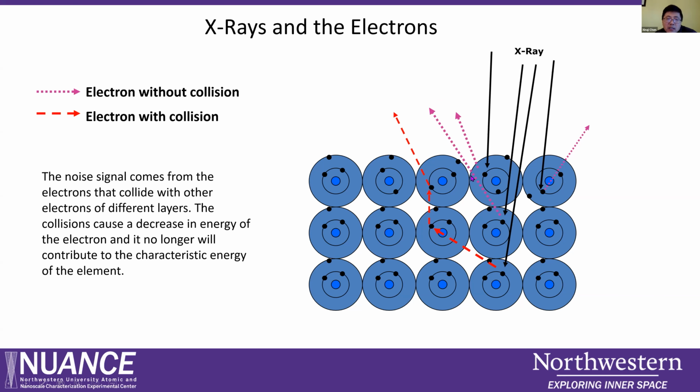So that's why on the spectrum, on the high binding energy side, which means the low kinetic energy side, the background gets higher and higher, because more and more electrons lose energy. That is the inelastic collision inside, and it contributes to the background. If the electron is deeper, because it lost energy, it cannot come out or contribute to the peaks. So only the top few layers can give information for the spectrum.